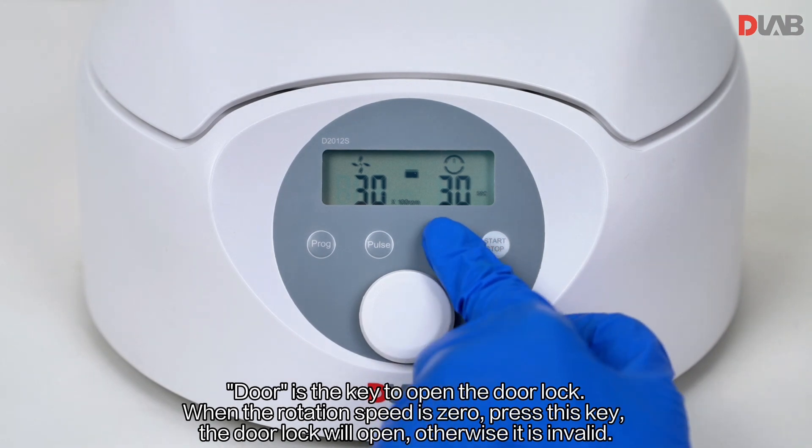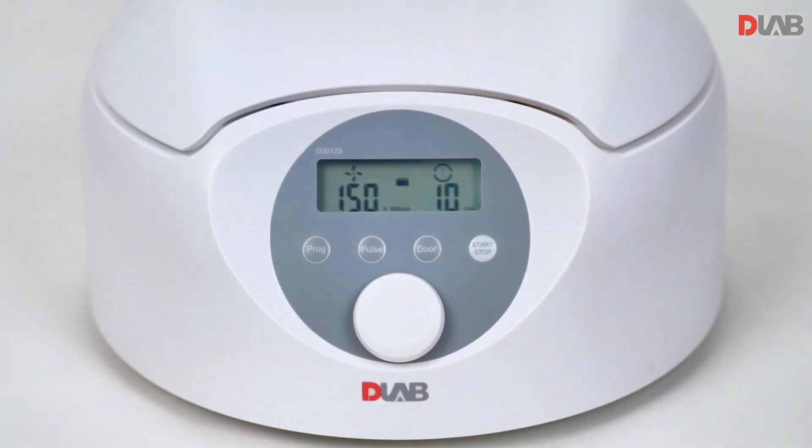When the rotation speed is zero, press this key. The door lock will open; otherwise it is invalid.